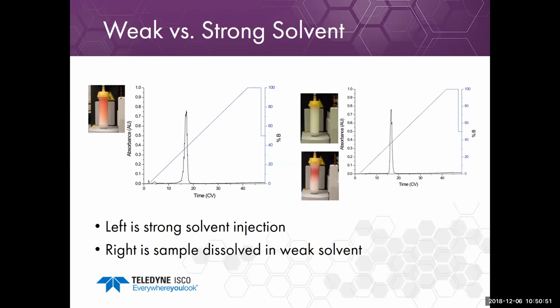The other question is the best way to wash the solvent modifiers. The best way is just to wash with your mobile phase but without the modifiers. What I will often do is combine the two wash steps, that is wash any sample off the column and wash out the modifiers by just flushing my column with either acetonitrile or methanol, and then I'll put the column away with those solvents in it.